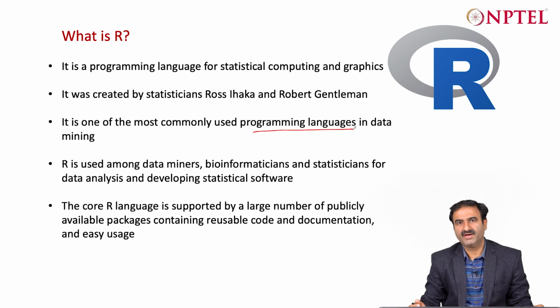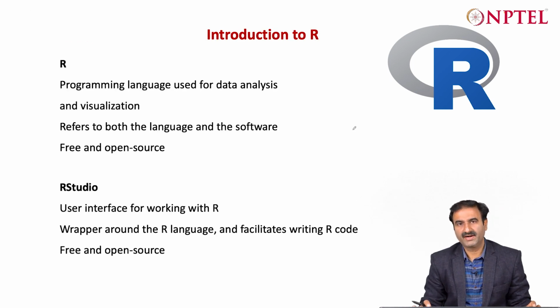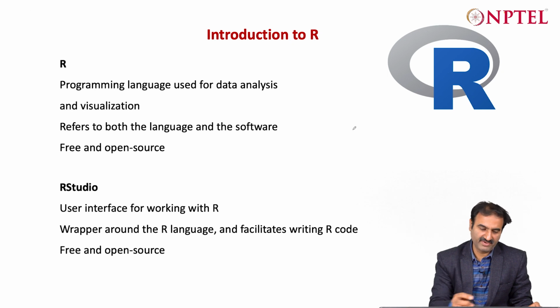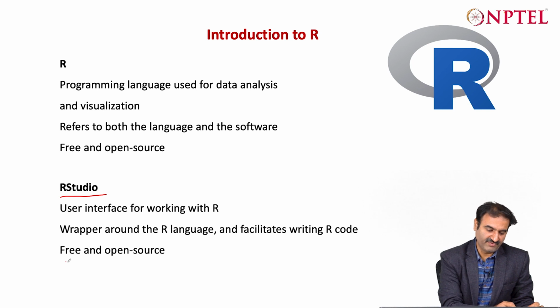There are so many tools and additional software developed by people, and you can find published versions in GitHub and also in the R library, which you can directly download and use. R can be used from the command line, so you can download the command line version, or you can have a GUI based version called R Studio, which is very good and easy to use. It gives you a nice interface where you can write your code, manage data and files, delete files and make plots. R Studio may be more convenient, and it is also free and open source, which is important.